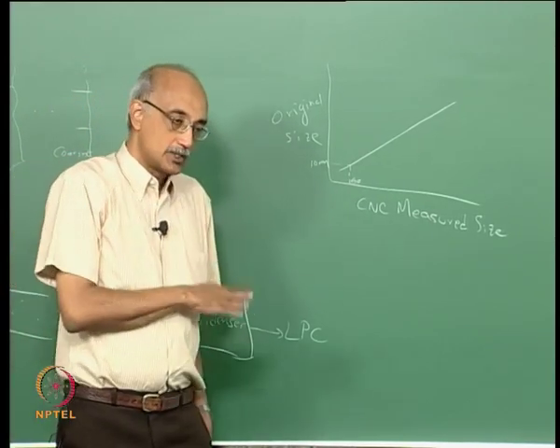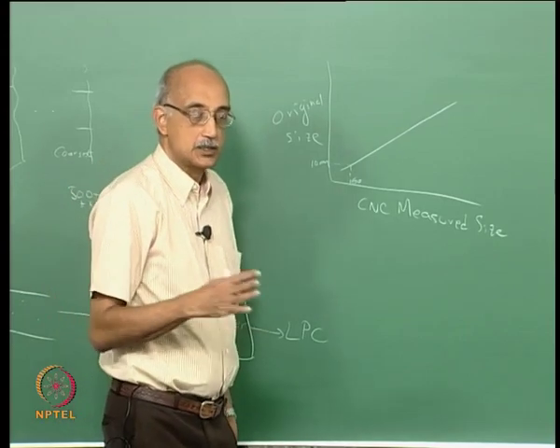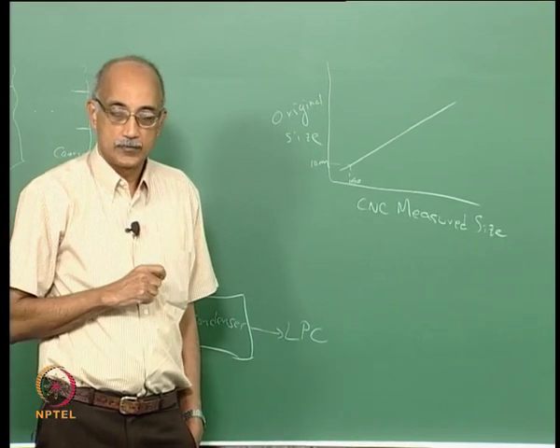So the development of this methodology has given us an ability to extend our light scattering based particle size measurement into even the submicron and nanometer size ranges.